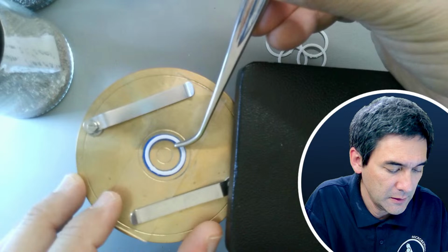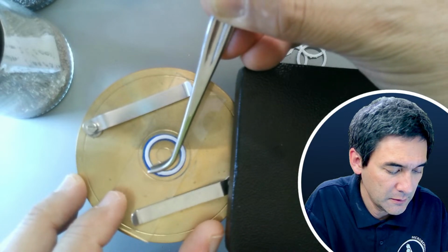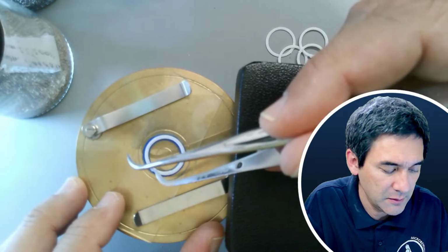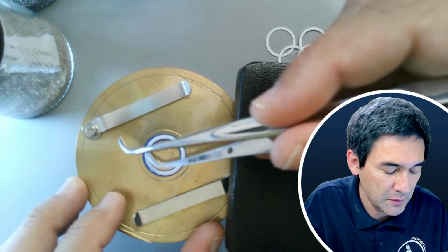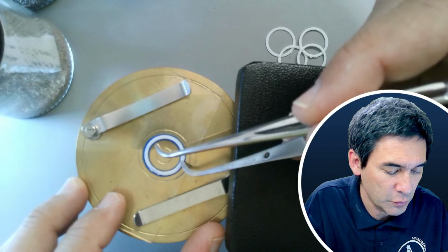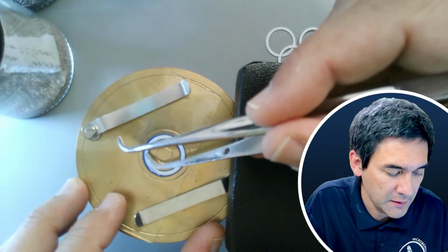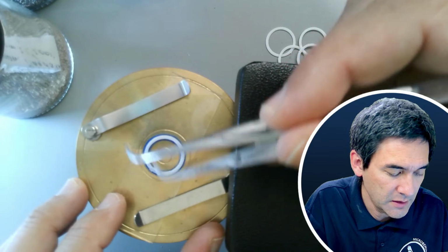Okay, and here we go. I think this looks actually much nicer than the other ones that I made. And then you give it an hour or so for drying. Maybe even less. But I think this one is okay.